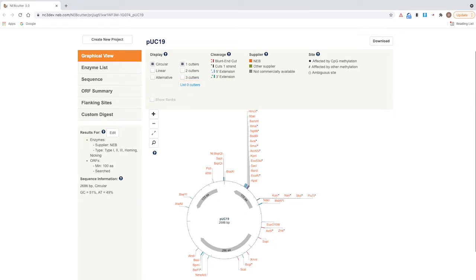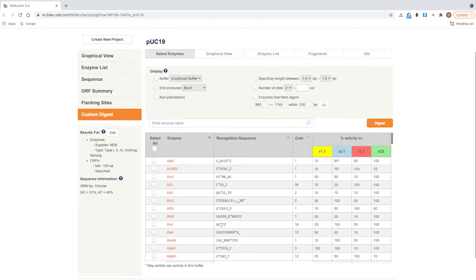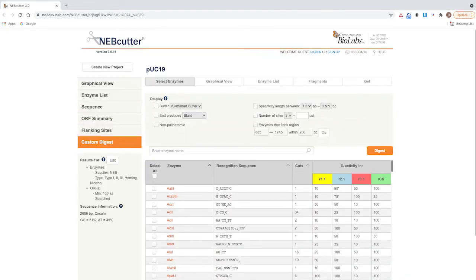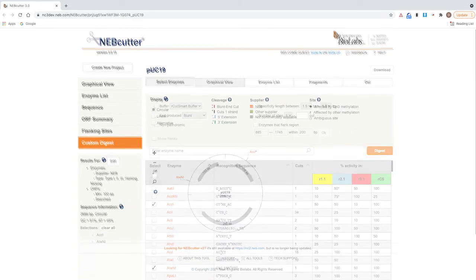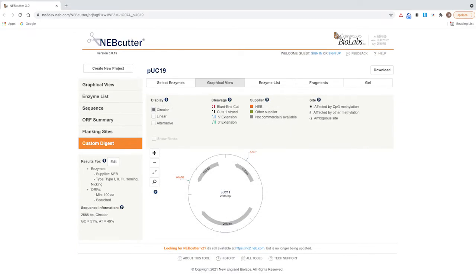For a full list of restriction enzymes with recognition sites within the DNA molecule, select Custom Digest. Select enzymes of interest and then click Digest to visualize where the enzymes cut on the DNA molecule.